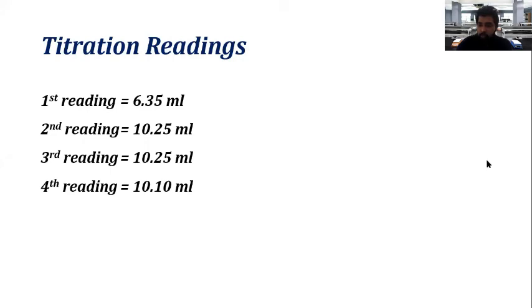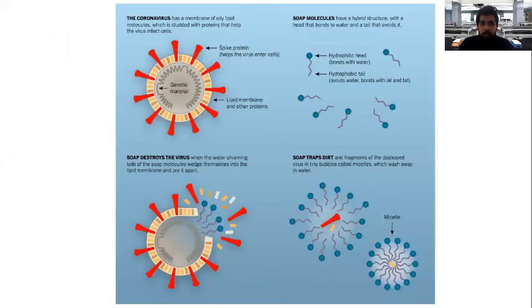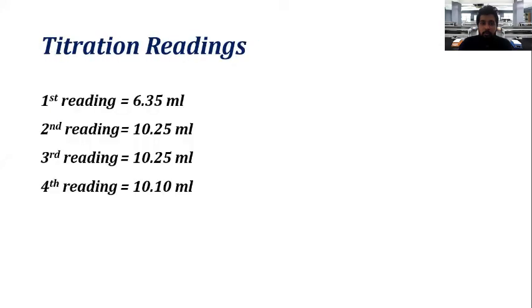You have to submit a practical report for this experiment, the determination of acid value. You have to understand why we didn't get the average titration readings. Sometimes we cannot do that.